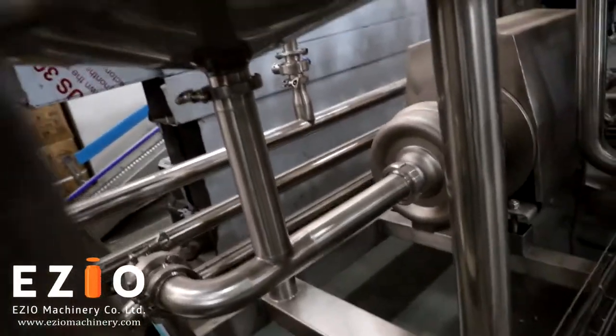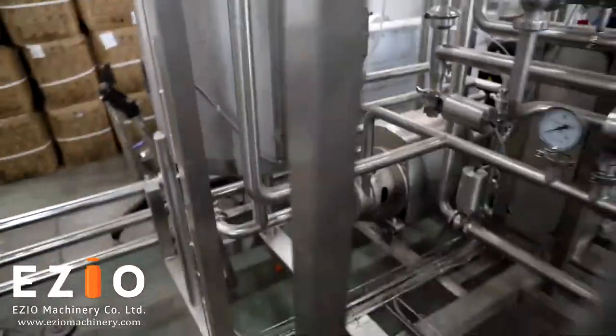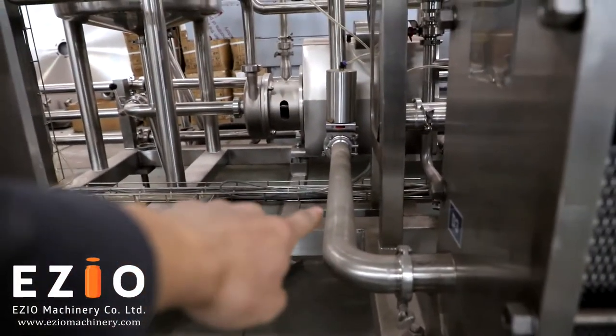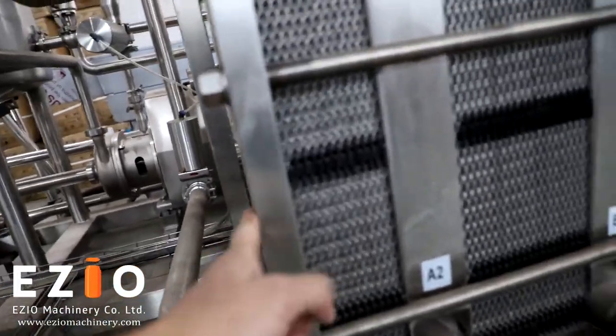Then the product will be pumped by this large pump to the heat exchanger. The product comes in through the inlet pipe and goes into the heat exchanger for pasteurization.